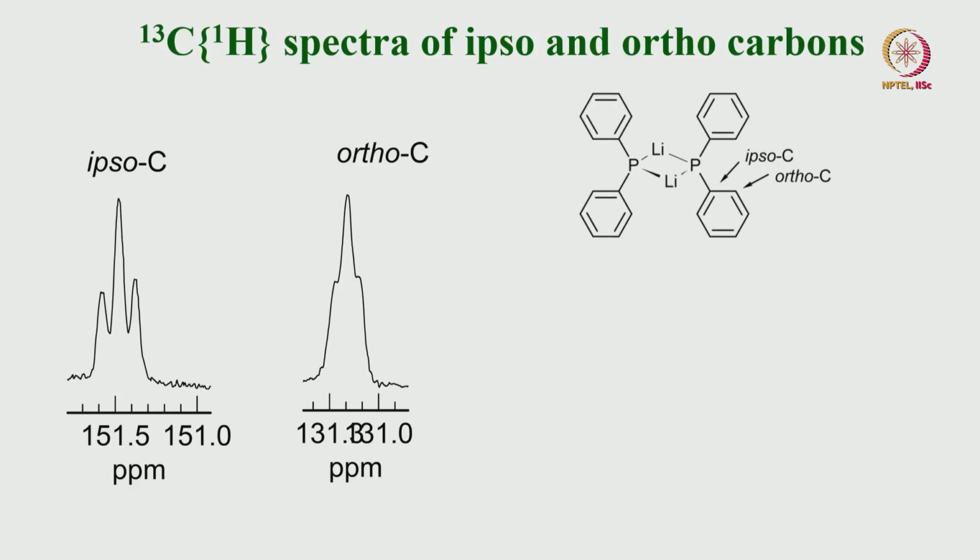Very easy. And if I look at the carbon 13 NMR of it with proton decoupling, you must get only phosphorus-carbon coupling. I am decoupling proton. I am looking at carbon. And two carbons are close by.